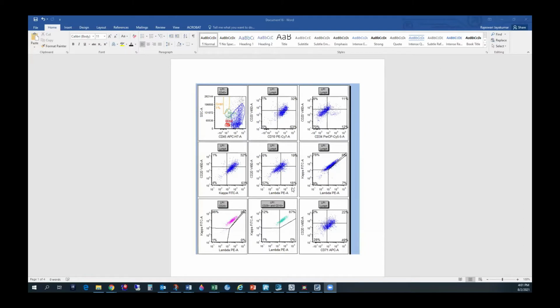One of the participants, can you tell me what you see? We discussed this, but I got a good example today. So this is a lymph node, and we performed flow cytometry, and this is a B cell tube. I do not know, but this kappa and lambda, which is just on that line, does not look fine to me.